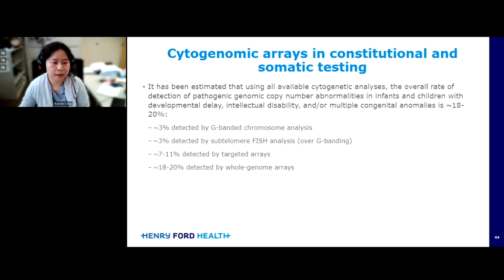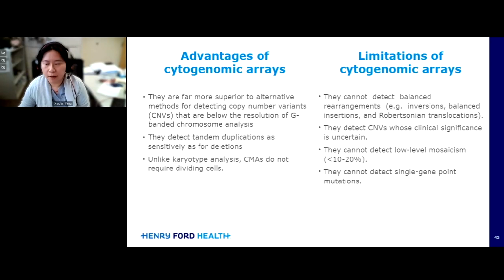All right. So overall, I think I summarized the samples and the advantages for microarray in both somatic and constitutional settings for research.